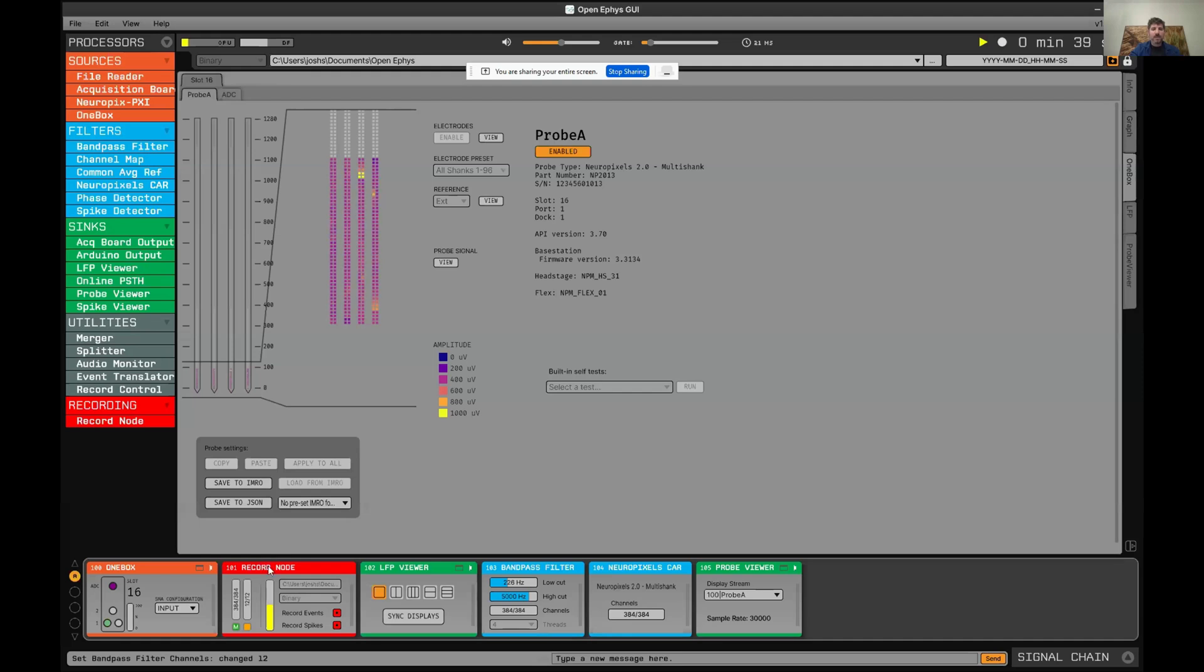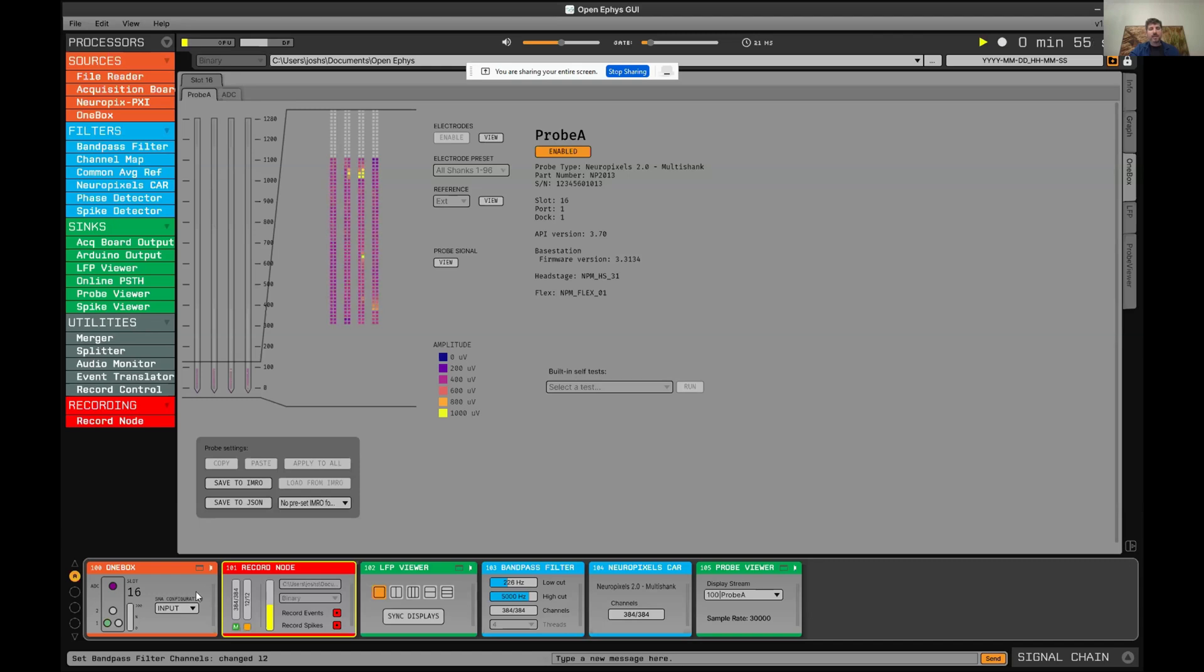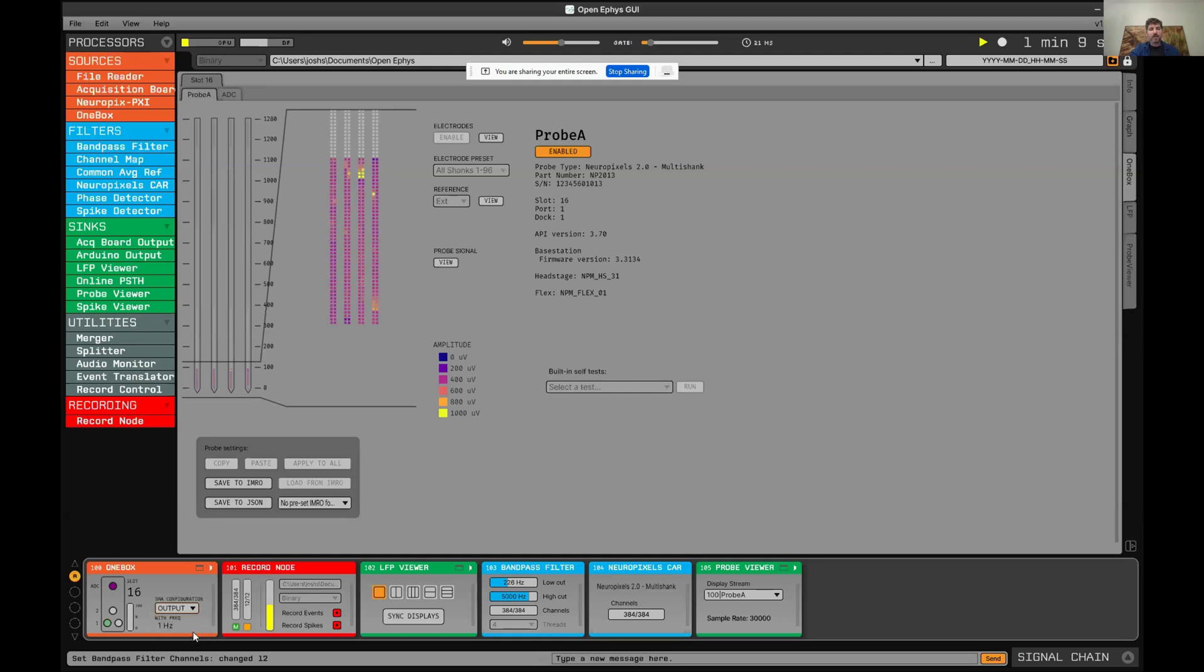One important thing to pay attention to in recording is whether your streams are synchronized. There's this little synchronization monitor down here, which will turn green if all the streams are receiving a hardware input that indicates that they are synchronized. In the case of the OneBox, you can change this SMA connector to either serve as an input, for example, it takes the signal from Arduino, or serve as an output and generate its own one hertz signal. If it's serving as output, it will also send that signal to the ADC channels.